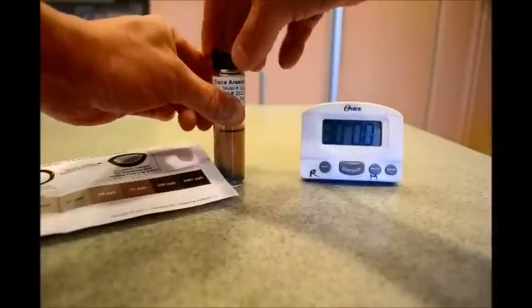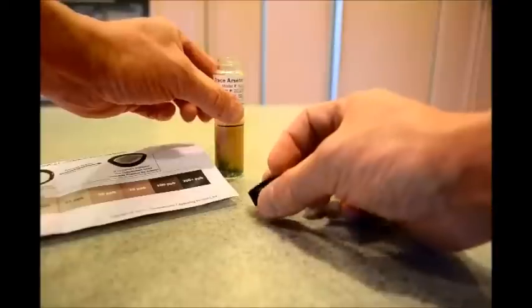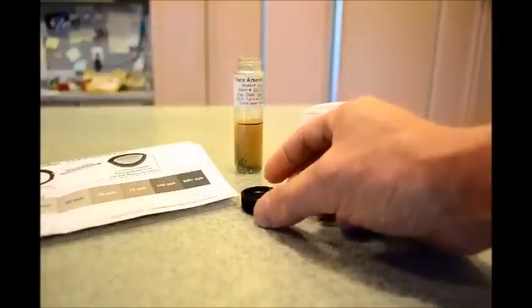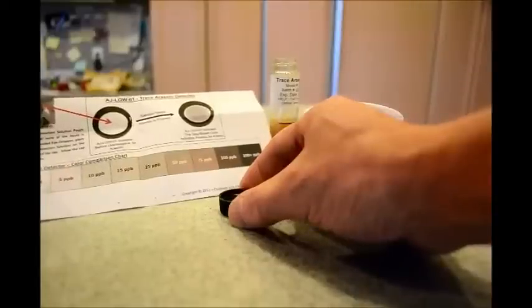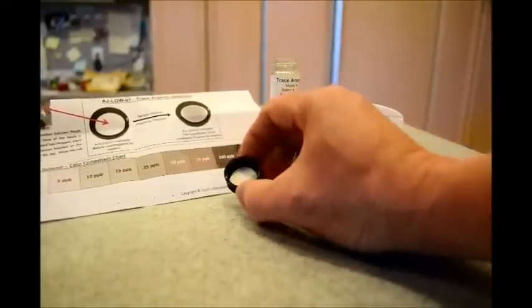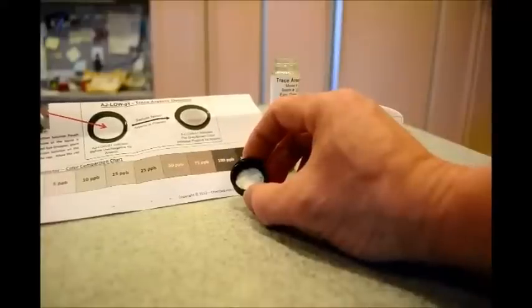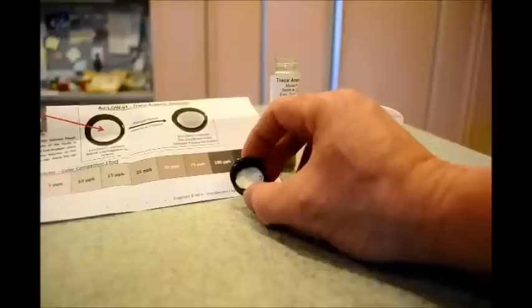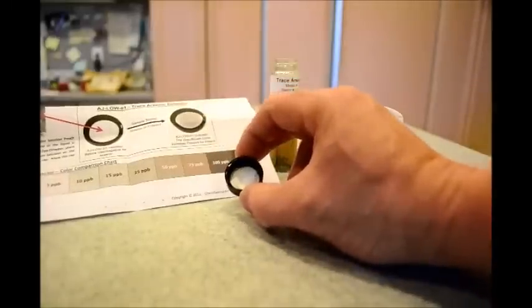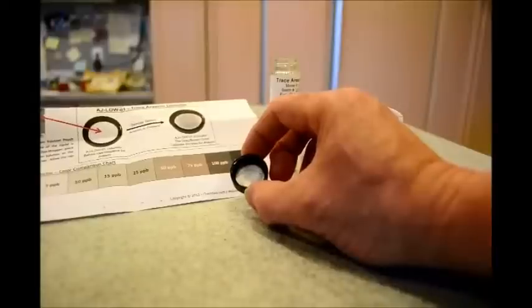Unscrew the cap and compare to the chart. As you can see, there is no arsenic in baby food. The cap is white — there is no coloring here corresponding to the chart. There is no arsenic in baby food.